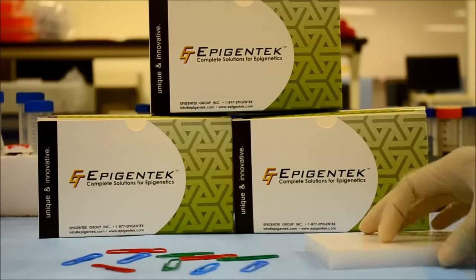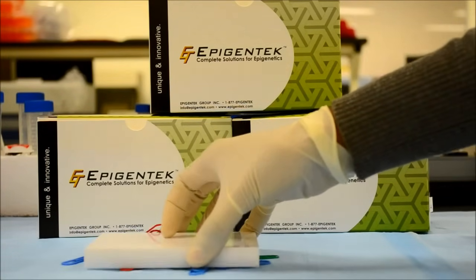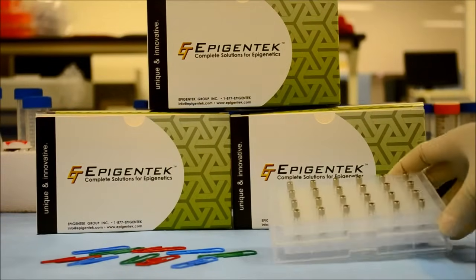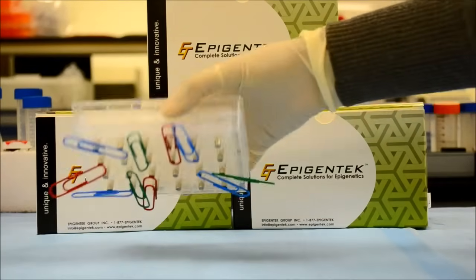Compared to similar products on the market which fall short on magnetic strength and take longer for sample separation, with less than stellar results, the EpiMag's Neodymium Iron Boron Rods are designed to be extra powerful for ideal results.